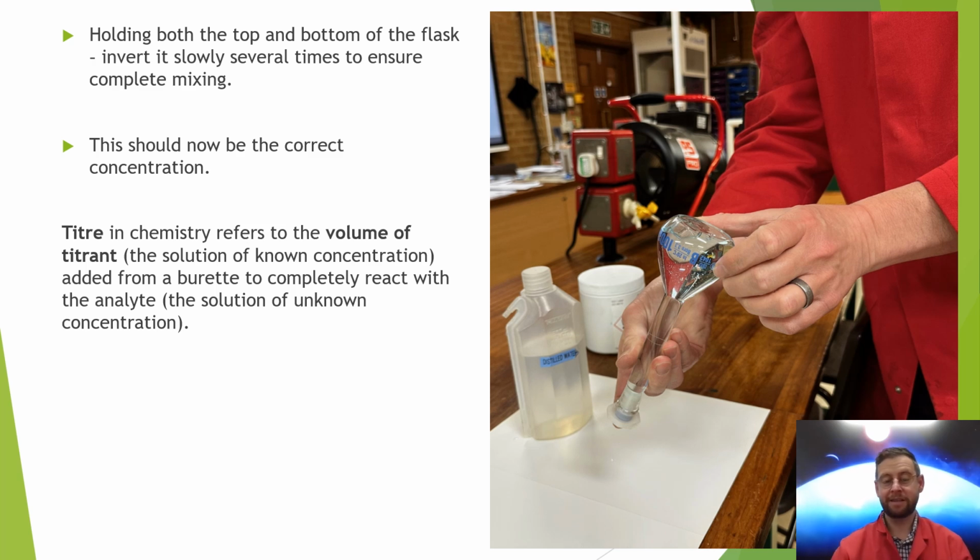Now the amount of this titrant, which is what it is now going to be called, that's going to react with the analyte, the substance in the conical flask, is going to be known as the titre. And so we're going to use these words to describe it from now on.